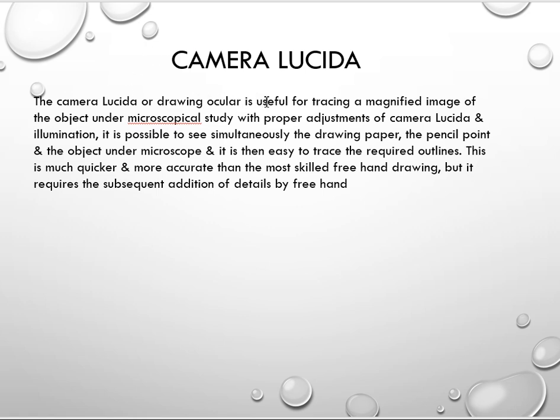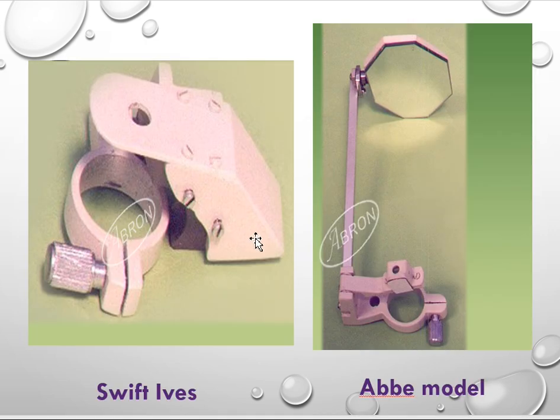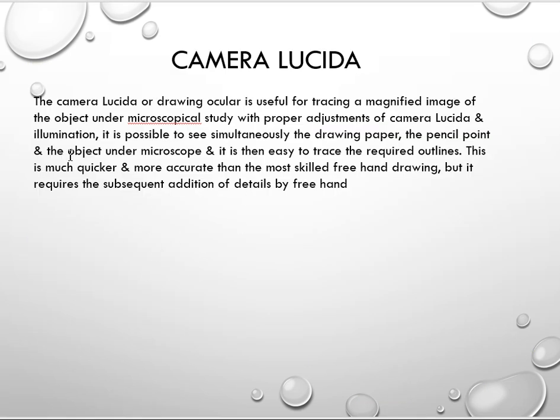The camera lucida or drawing ocular is useful for tracing a magnified image of an object under microscopical study with the proper adjustments of camera lucida and illumination. It is an instrument that we attach at the top of the eyepiece, and it is an ocular device such that whenever we are tracing on the paper, your hand can be seen through that camera lucida.